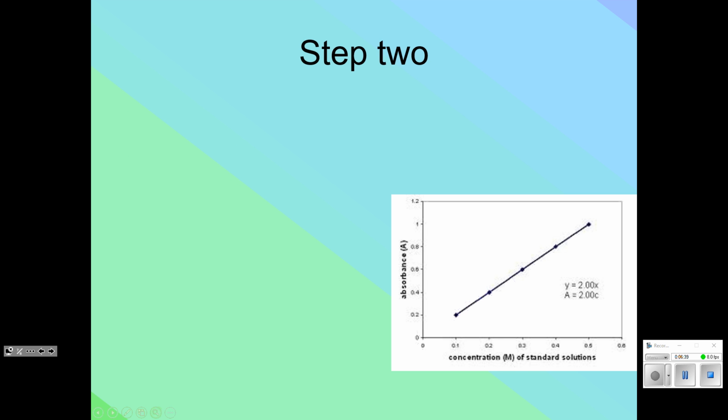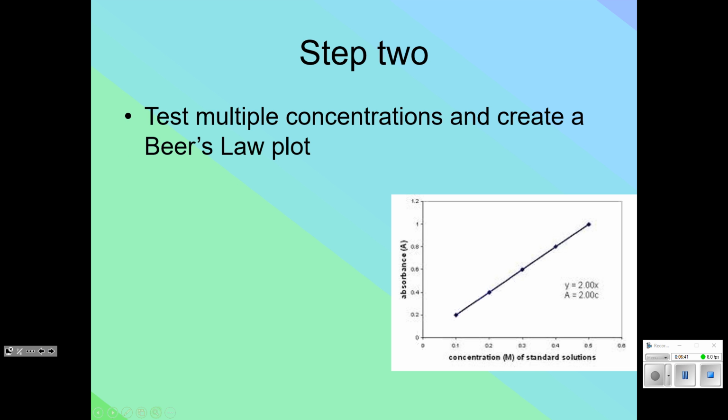Next class, we are going to do what's called a Beer's Law plot. The sheet you picked up on the way in covers the Beer-Lambert law, which is something AP expects us to know about. There are two ways we can do this type of work with a spectrophotometer.